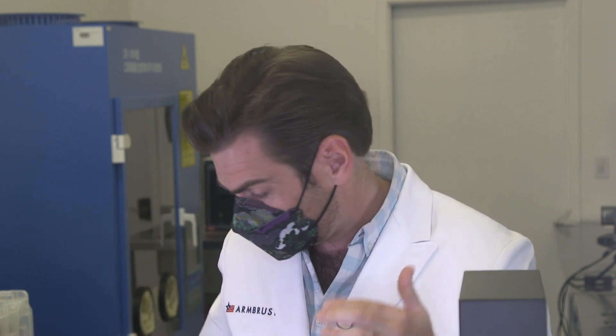Let's try this. The smell is delightful. It's very easy breathing. I'm not getting a good seal though — the nose wire is not good on this. When I push on this, it's coming up. I'm getting a lot of gap. I just think if they upgraded this nose wire, this would probably be one of the best masks I've ever used from a style perspective. But does that matter if it doesn't protect you? Let's check out the results.